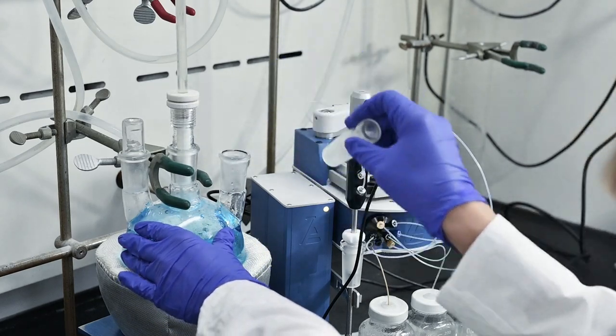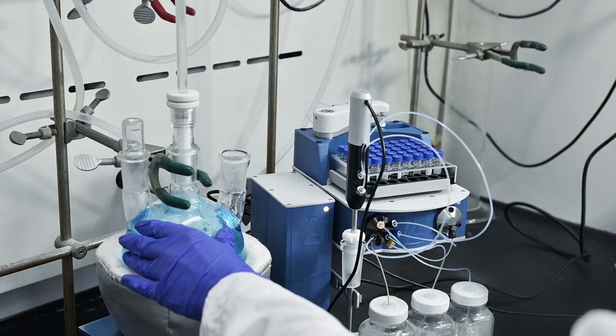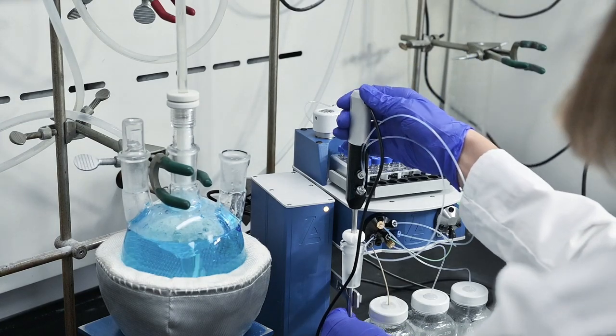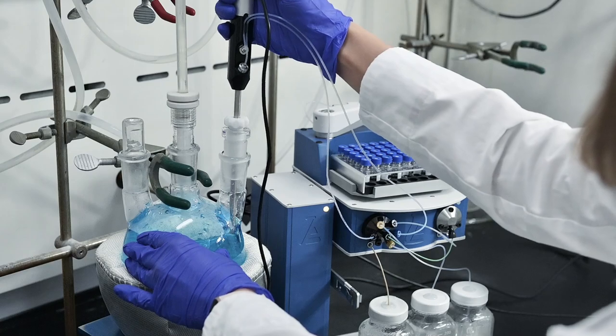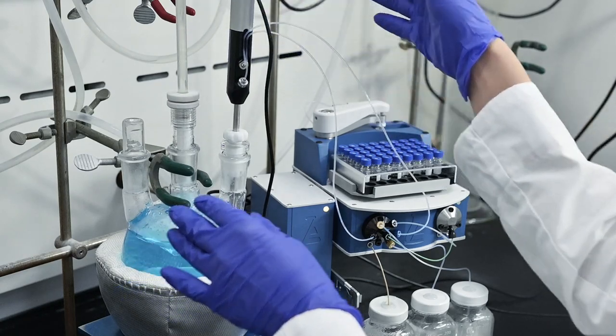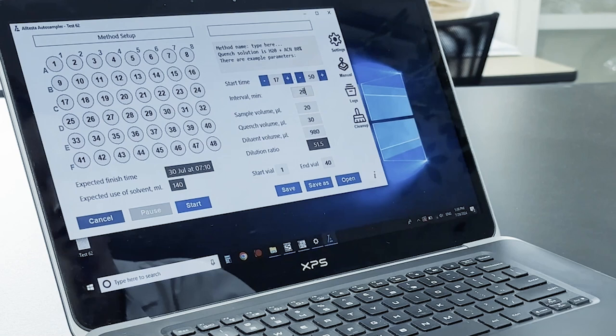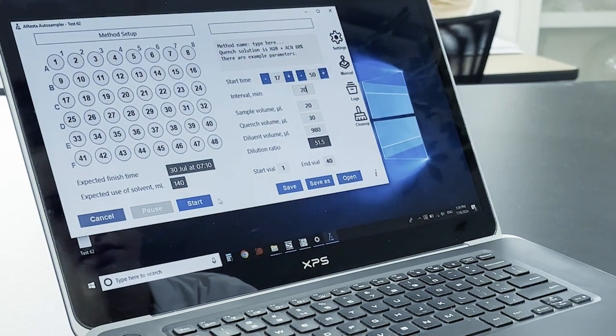It includes an emerging probe which is connected to an auto sampler with 48 vials or 96 well plate capacity. It operates by cloud-based software which allows monitoring sampling from your office or home.